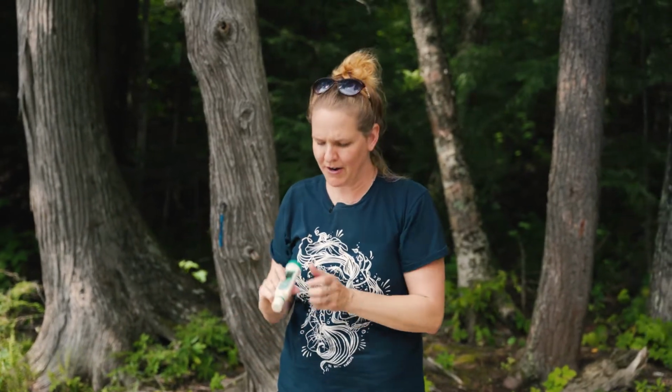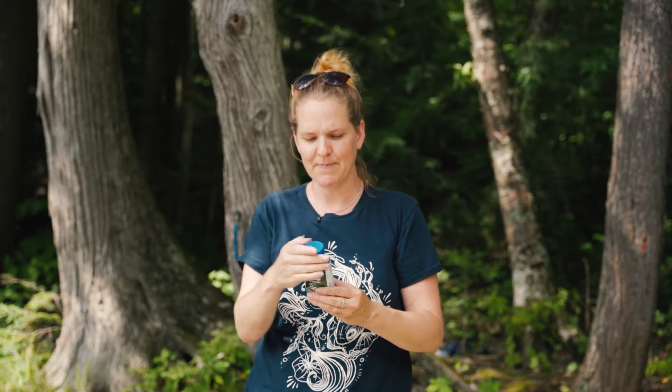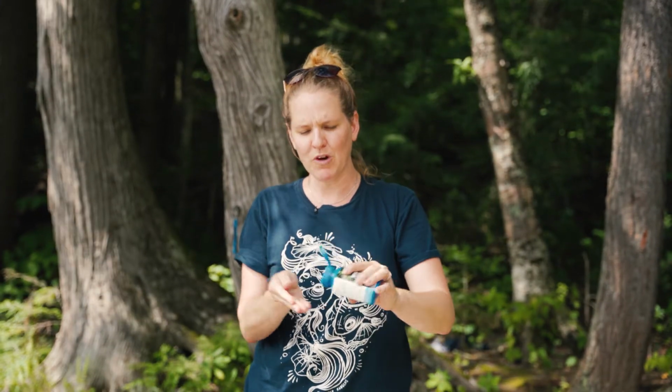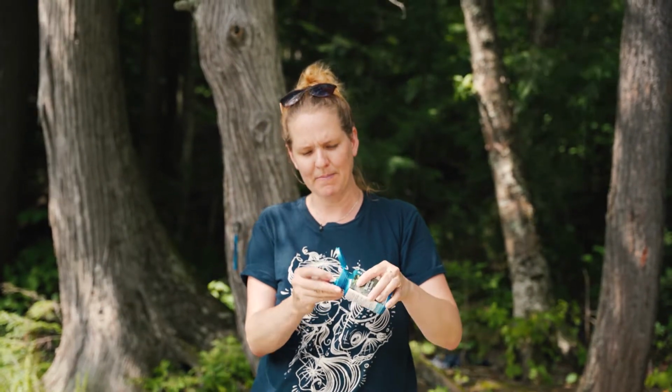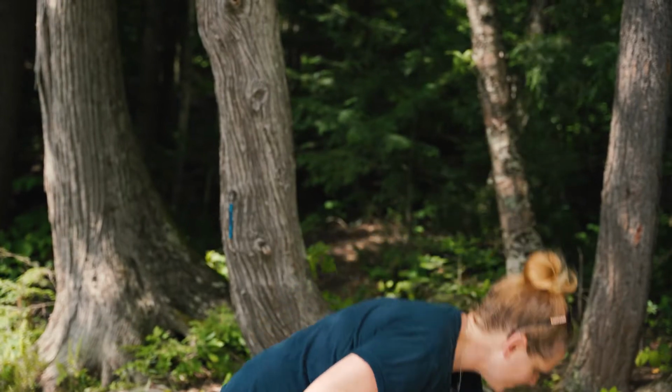To turn off our meter, I'm just going to press the top button once, and that's going to preserve my battery. Next, we're going to use these test strips to test for chlorine, pH, alkalinity, and hardness. Very important that your hands are dry for this. We're going to open the cap, shake out one test strip, grab it, and then close the container right away. We really want to make sure we don't get any moisture in there.